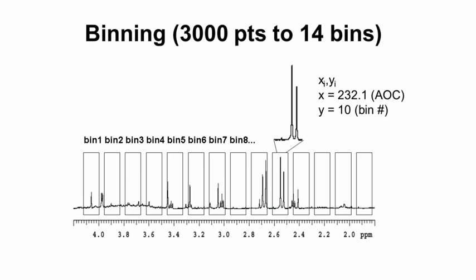So here's an NMR spectrum, and essentially we've drawn bins of roughly about 0.1 ppm width around different regions throughout the spectrum. The bins cover essentially peaks and in some cases noise. Some bins have essentially no spectral information or just noise. Others have a few peaks. What we'll do is we'll measure the area under the peak and define the area under the peaks above baseline as the volume or area, or give a number to that particular bin. So in this way we can convert 1, 2, or 3 peaks, or tiny peaks and big peaks, into one value, which represents an area.